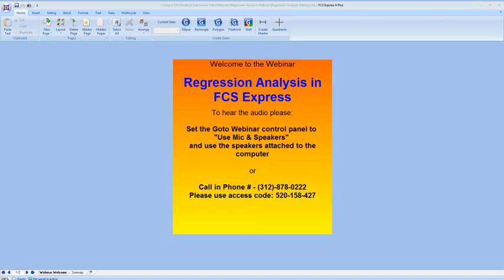We're going to be going over how to do regression analysis in FCS Express. It's one of our new and exciting features that we've added.